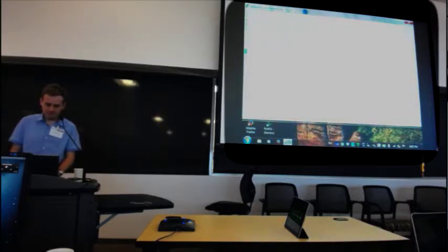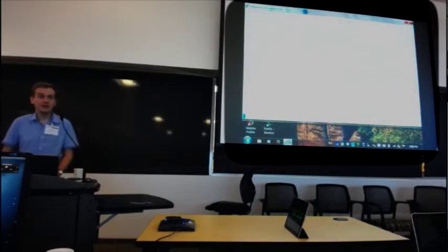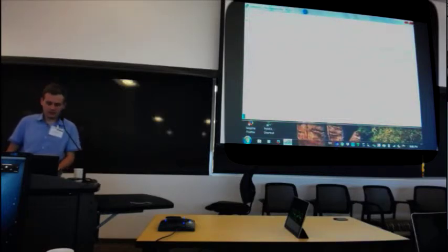And start converting all of them at once. I think it's PS, Q. You can pause it, put it in the background, and we'll go and submit all the jobs like that. Yeah, you can do it very quickly. I'm logged in on the same machine as them. Is there a reason the lines are different for each? Yes, there's a very good reason.